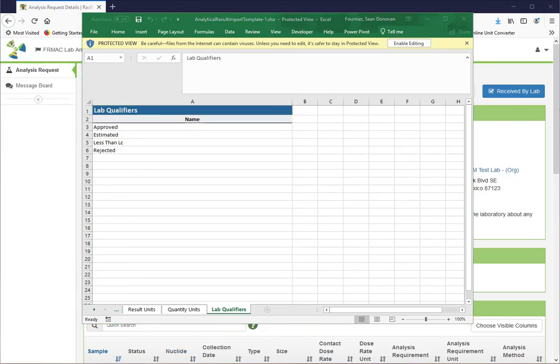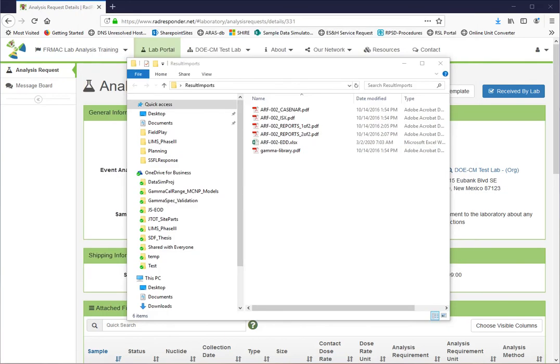Next, we will describe what is typically included in a laboratory data package. While the specific requirements may vary, a laboratory data package may contain the following elements: a case narrative describing what was done with the batch of samples, including any summary information pertaining to the batch or batch quality control samples, or any problems encountered.